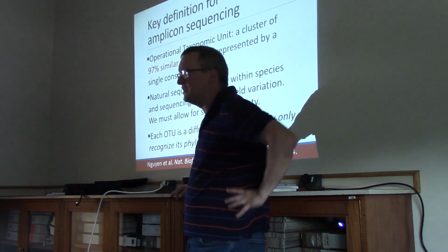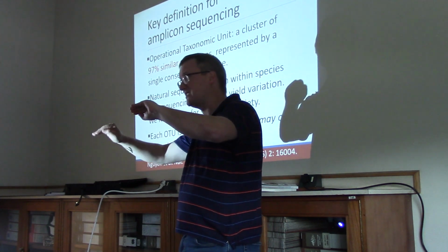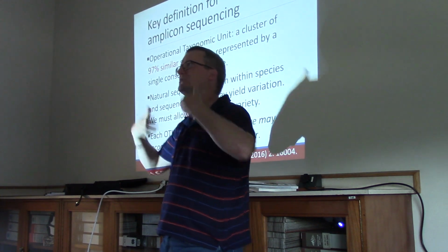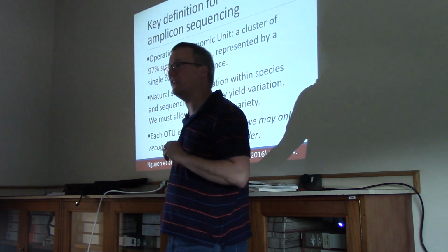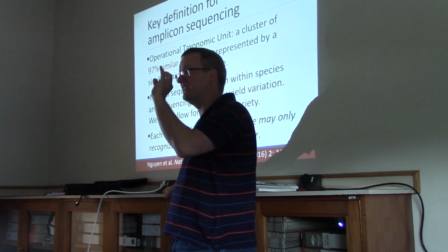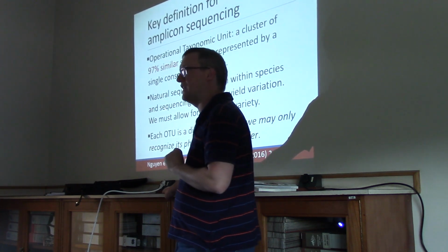Okay, so generally speaking, we find this whole set of sequences that are quite similar to each other. We form a consensus sequence, consensus meaning something that captures the most typical sequence through that OTU. And then we will try to figure out from that consensus sequence what the best genus and species label to hang on that OTU would be. We'll be talking about different software that we use for that purpose.